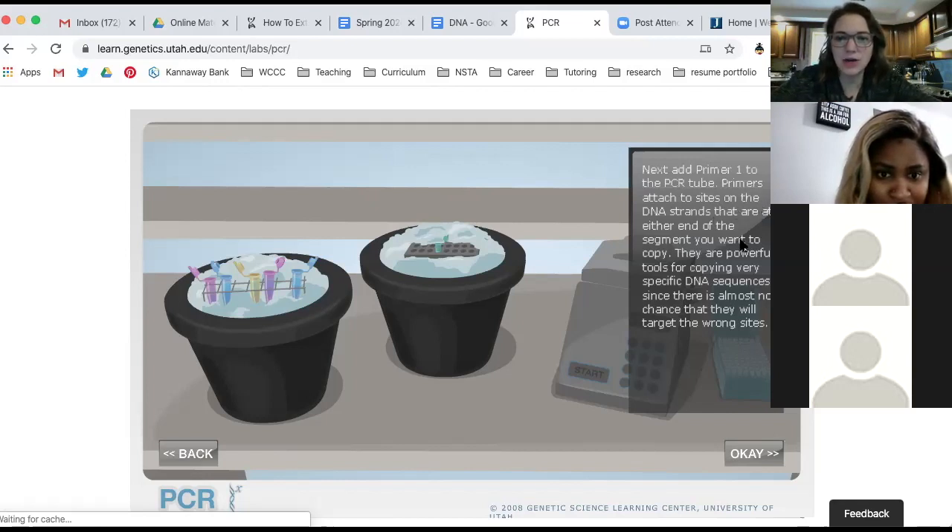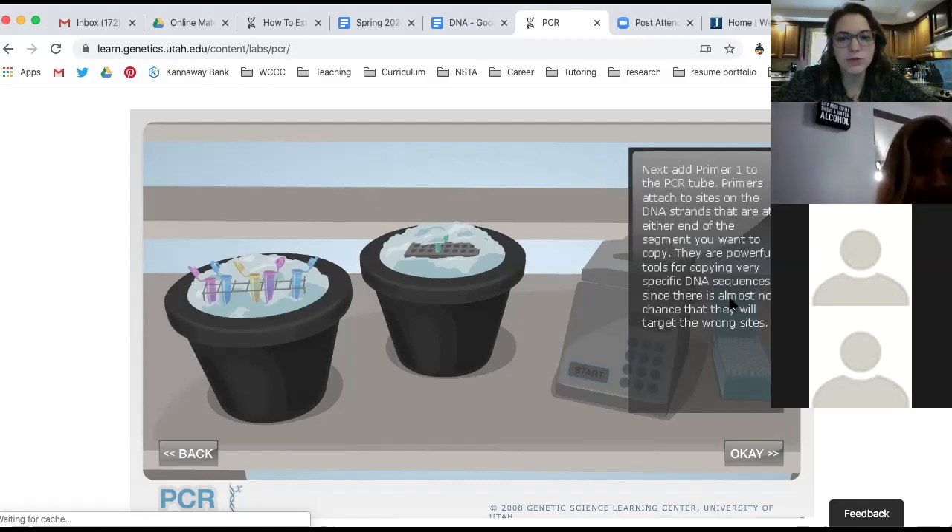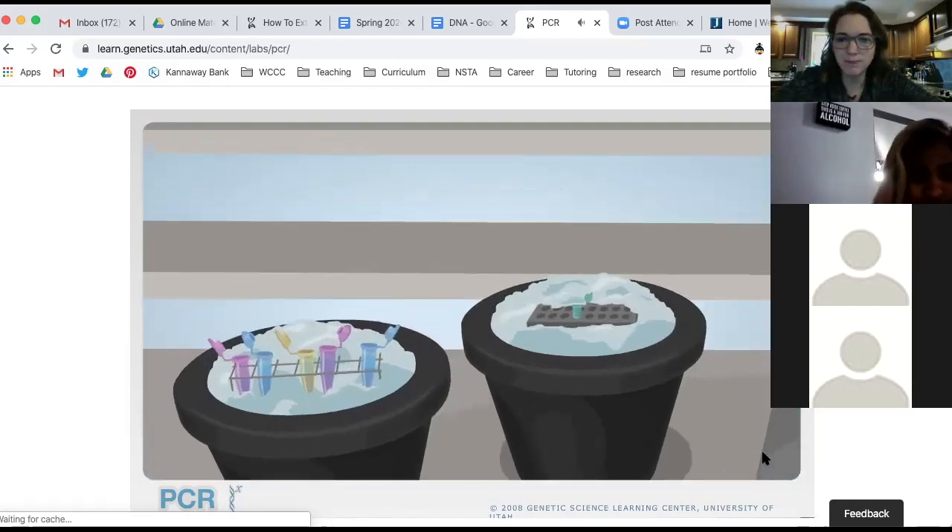Let's say we're looking to see if somebody has the gene for Huntington's disease. We know where the gene is, and we know that prior to that gene there's a segment that is AAATCA. We'd use the primer in this specific PCR reaction that matches that segment — because then we know it's like a 'you are here' marker pointing to the Huntington's disease gene right past it. So you're going to add primer one using a micro pipette — working with very tiny microliter amounts. Now add primer two, which is going to attach to a second site on the DNA.